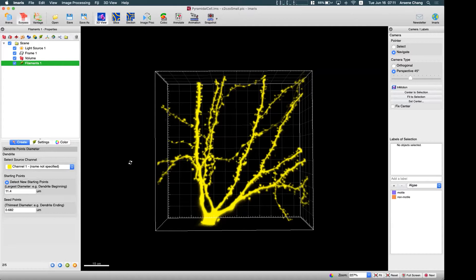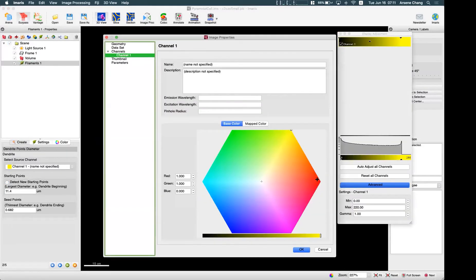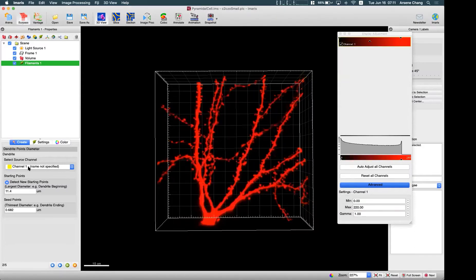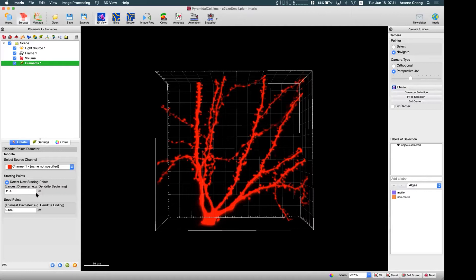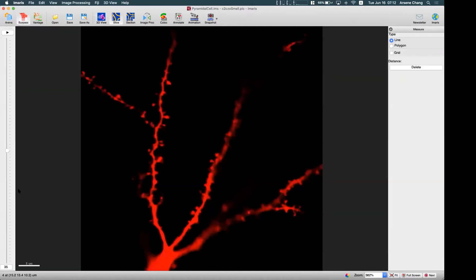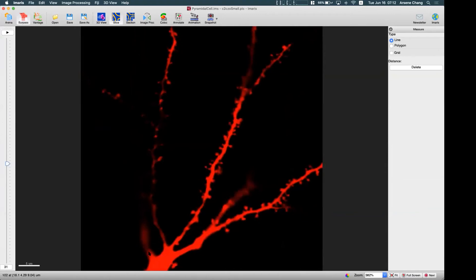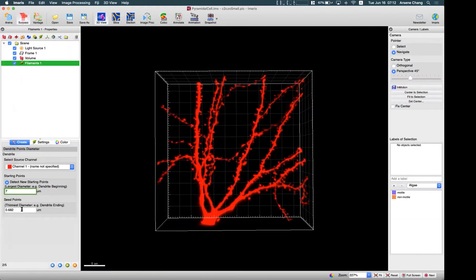Here we select the channels. To visualize it better, I want to change the color of this channel to red. We choose channel one and we need to give Imaris two numbers. The first is the starting point — where the trace starts. For this kind of branching neural structure, we start from the cell body. Going to slice view, the dendrite root is about 6.5, so we give a slightly larger number, for example 7. For the seed points, we enter the diameter around the dendrite ending, which is the thinnest part.